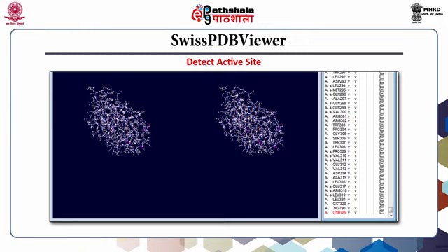Press Shift key and click in the first column of the control panel to mark all residue backbones as visible. Again press Shift key and click in the second column in the control panel to display the side chains. Again press Shift key and click in the fifth column of the control panel to hide ribbons, that is, to mark all ribbons as invisible.